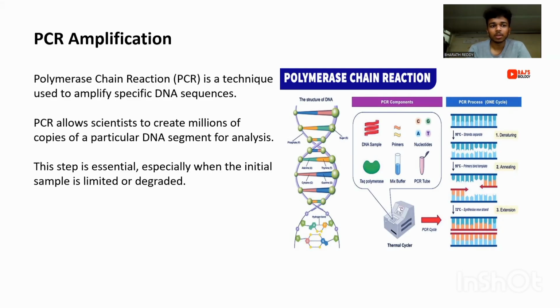PCR amplification, polymerase chain reaction. It is a technique used to amplify specific DNA sequences. PCR allows scientists to create millions of copies of a particular DNA segment for analysis. This step is essential, especially when the initial sample is limited or degraded.